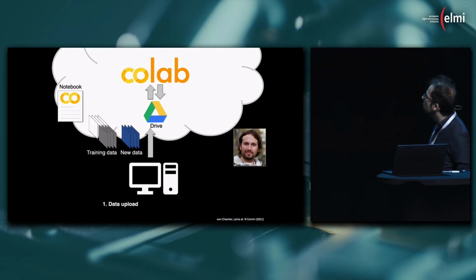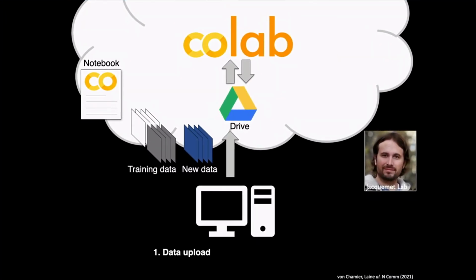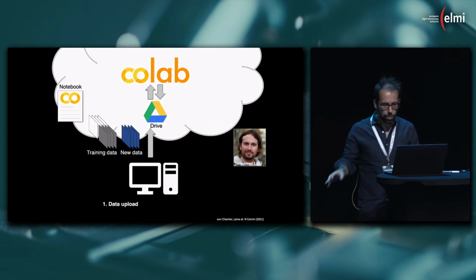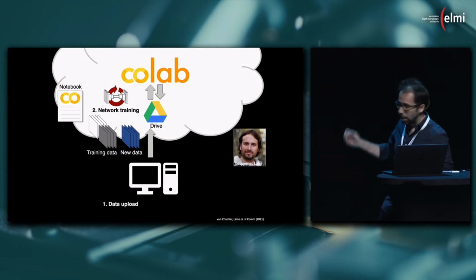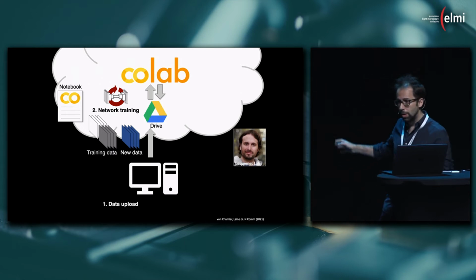So pretty much what we did is we generated a set of Google Colab notebooks that present an extremely easy-to-use graphical interface where you aren't expected to have any coding experience. So the only thing that you have to do is to interact with that interface. And next to that interface, you have full tutorials explaining exactly what each parameter you're playing with actually does. So it's actually an outstanding resource for you to learn how to use machine learning. With that, you can do network training on your data. If you don't have data, by the way, we also provide example data for everything that we do.